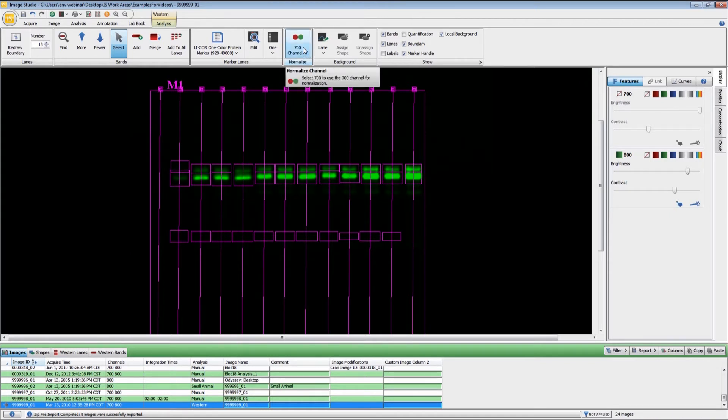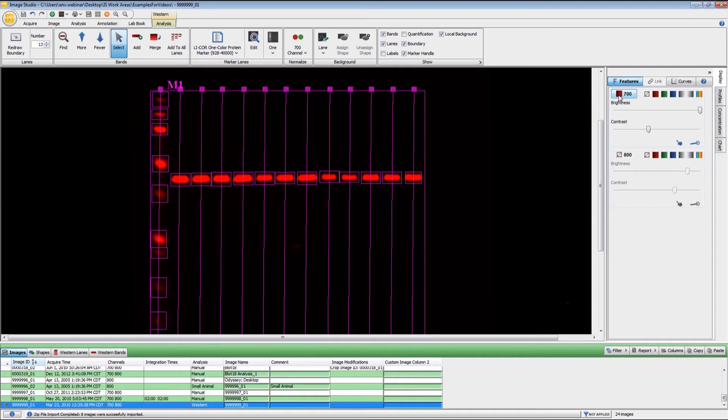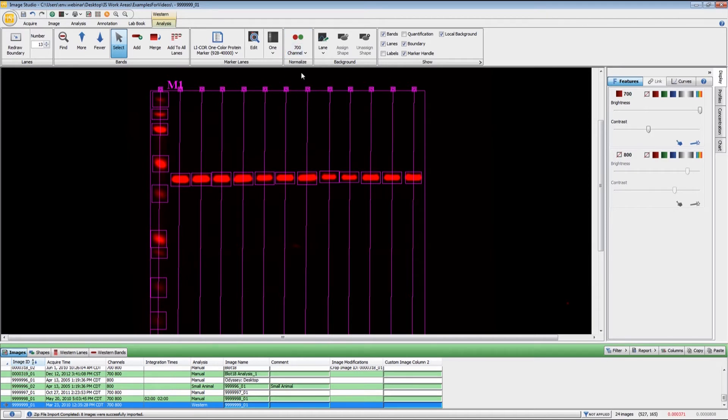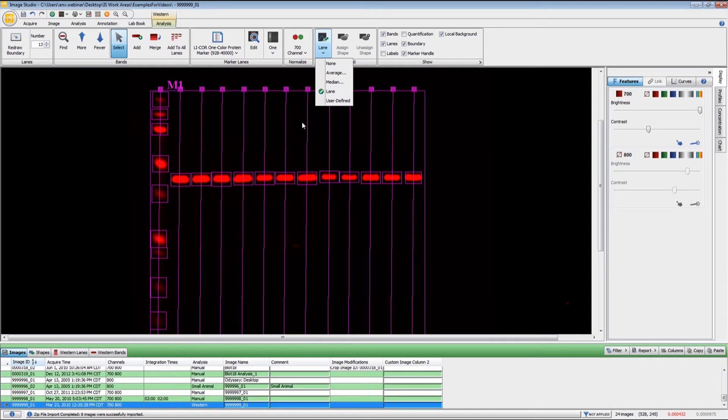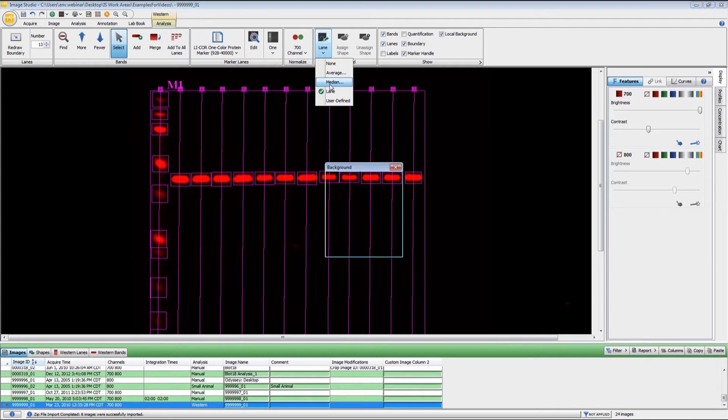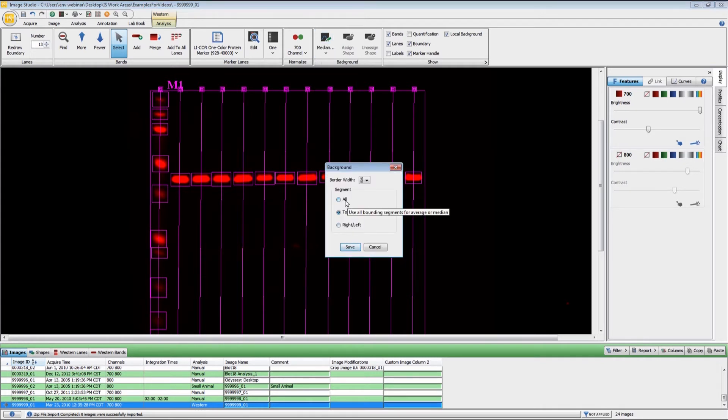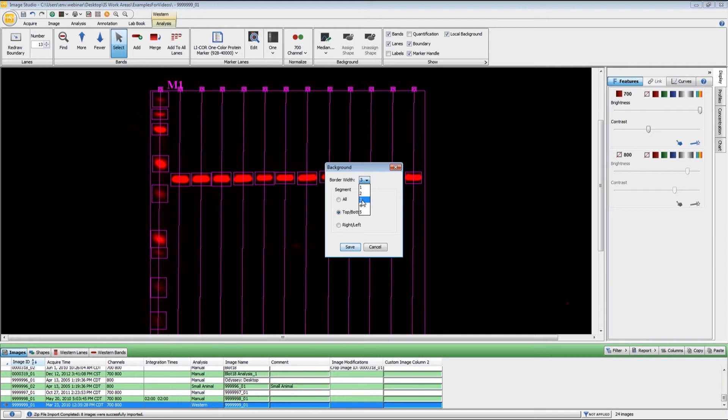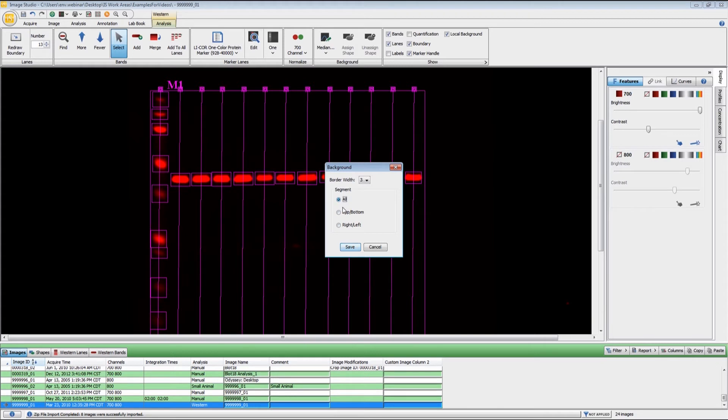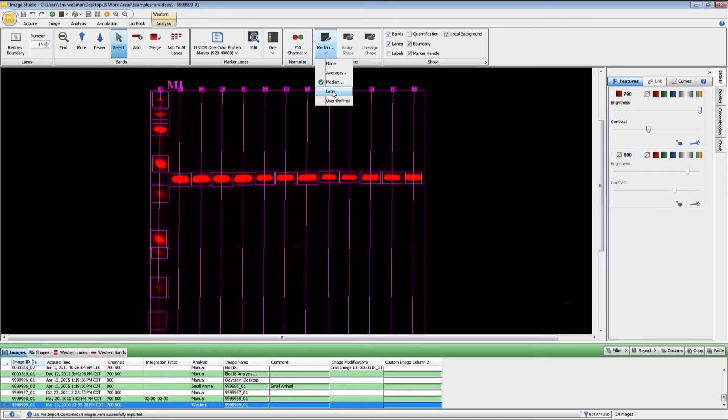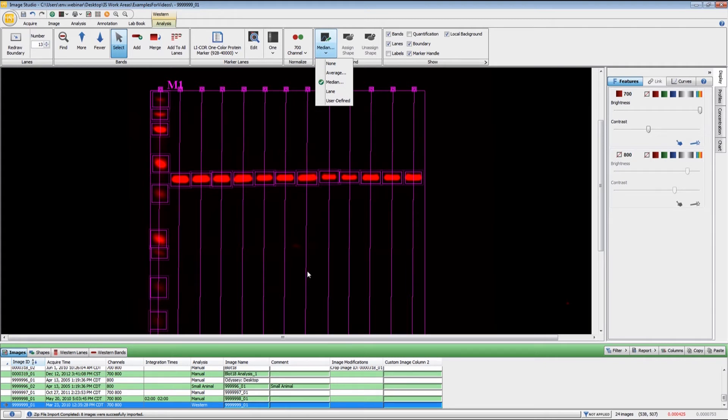You can also use the Western analysis to do normalization. You can set either the 700 or the 800 channel as your normalization channel, and for this particular image, I'm going to use the 700 channel, because this is my loading control. For background subtraction, you can use either lane right here, which will use the entire length of the lane, excluding the band areas for your background subtraction. The lane background will work fine if you have a clean primary antibody.